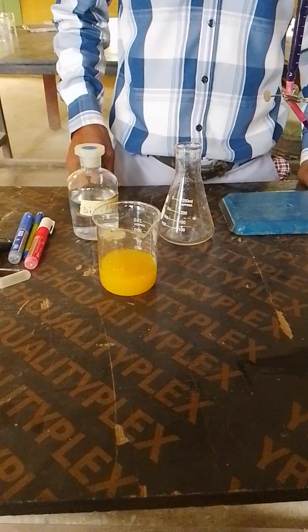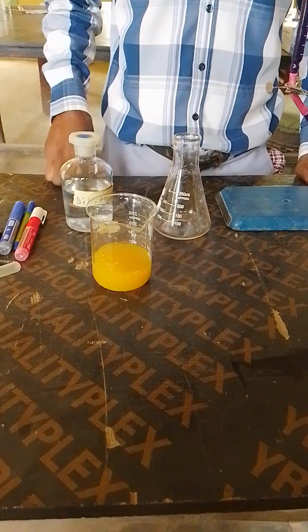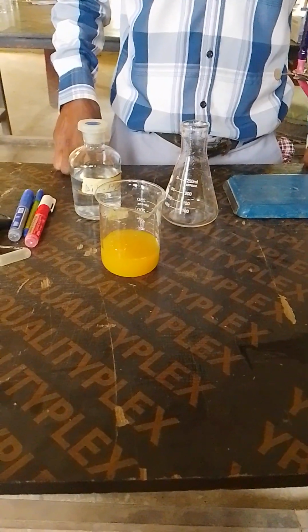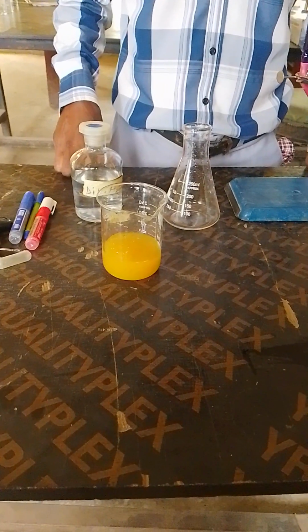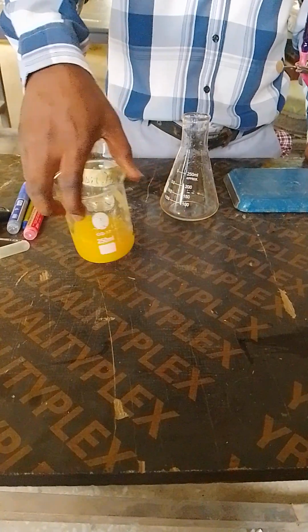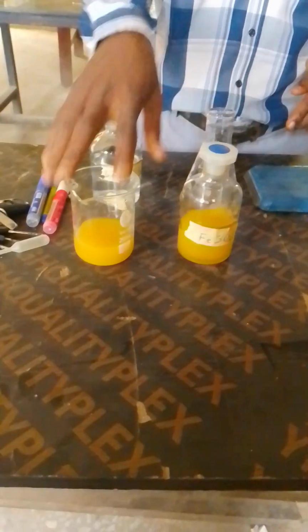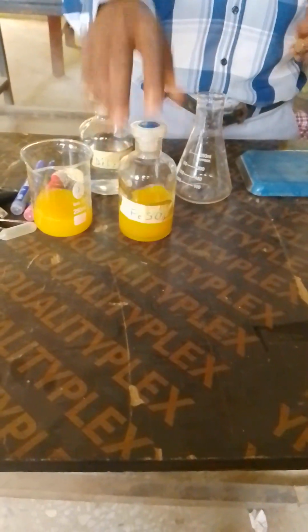2024 chemistry WAEC practical. If you have watched the previous video, you will see where I put up the qualitative analysis. Today I want to show you the volumetric analysis. For the information given to us, we have been told that we are going to titrate using FeSO4, that will be the reducing agent. I have KMnO4, that will be the oxidizing agent.